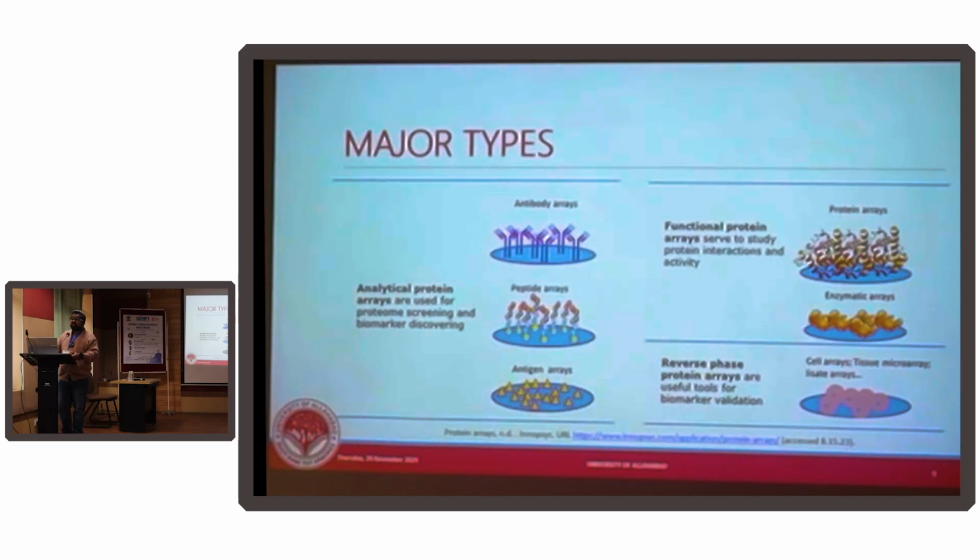You take a glass chip, you take a microarray printer with you, you take their blood serum samples, spot it on the glass slide, and then do one check, and based on the arrays, it can tell for those 500 patients at one given time if they're having a specific antibody, or if you are checking for a specific biomarker. So these are called reverse phase arrays.